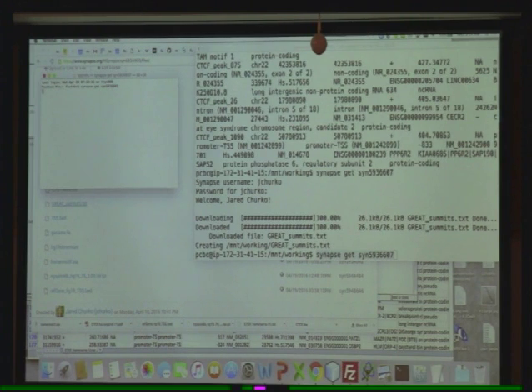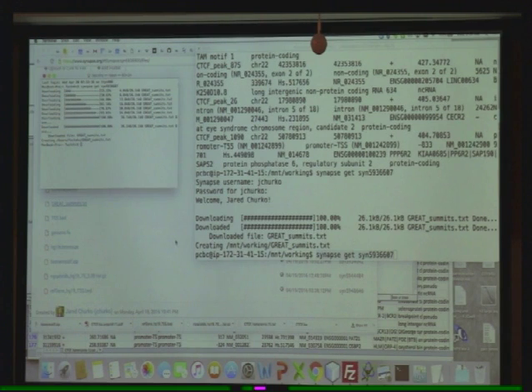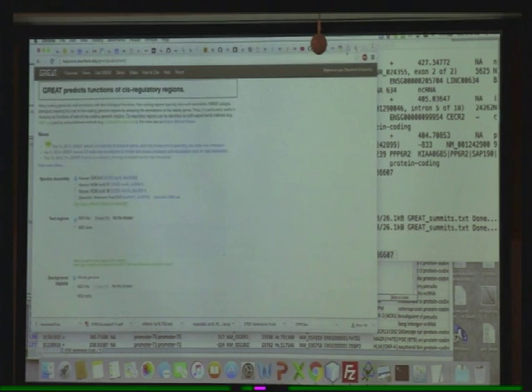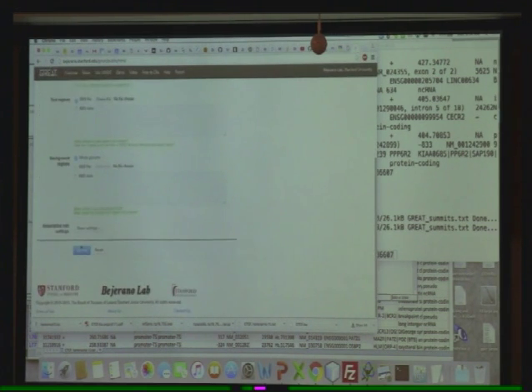Okay, did everybody upload that file? Okay, and then do the genome background, the next one. So I'll go back. Whole genome as the background, and then hit submit. Tell me what you get.